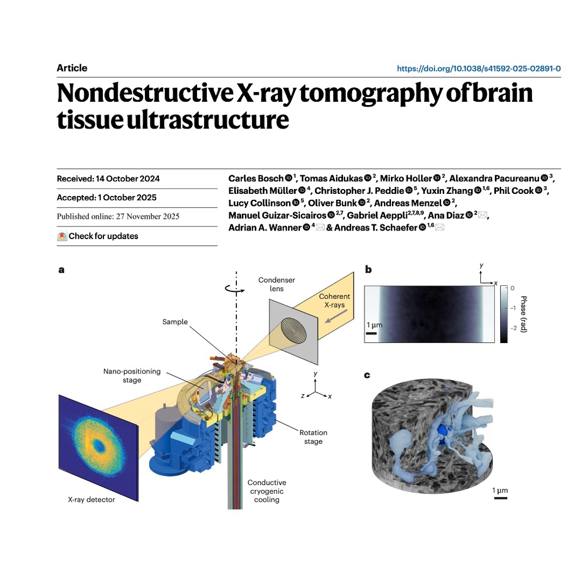What they do is they split the full angular range into multiple smaller subranges. So they take several low-resolution subtomograms at different times during the scan. So instead of one big, long, blurry exposure, they take a bunch of low-res snapshots of the sample as it's deforming, like taking a shaky video instead of one blurry photo.